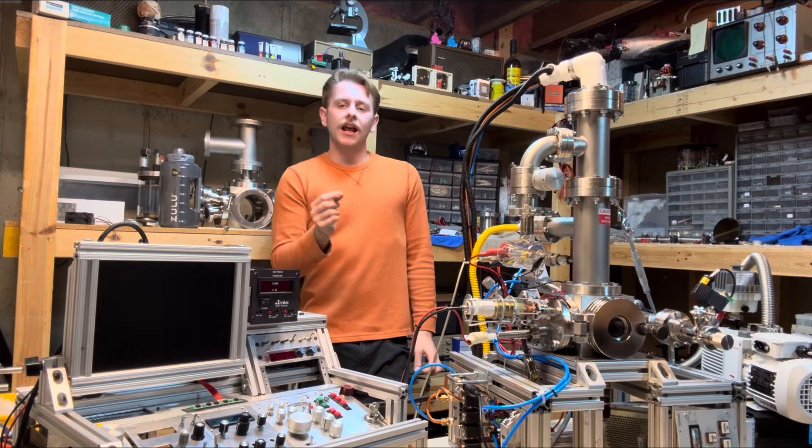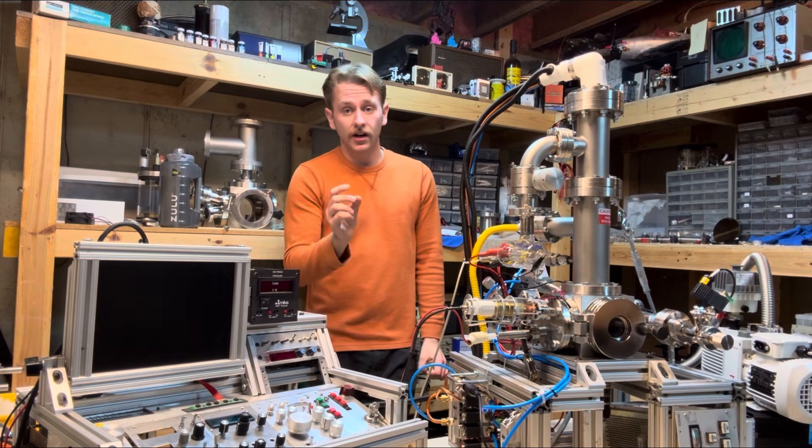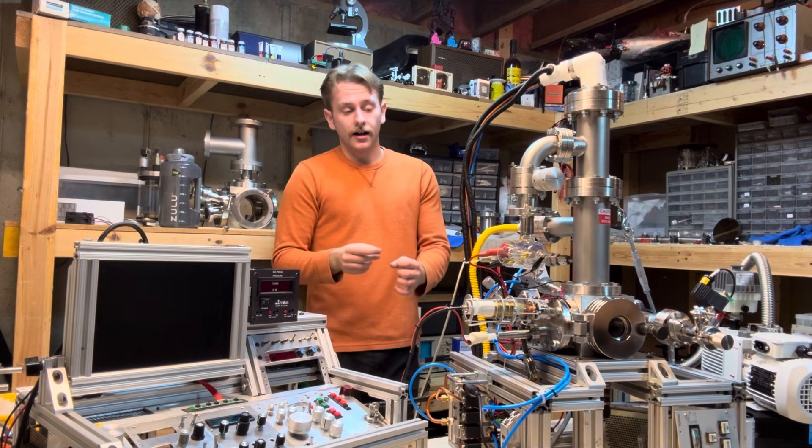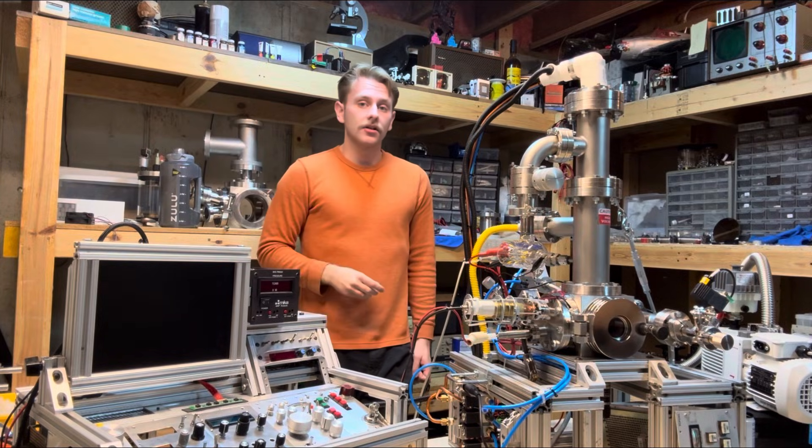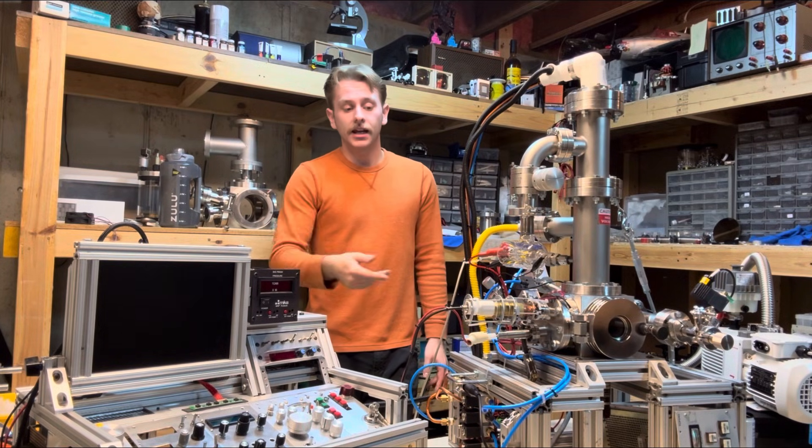So these electrons hit the plate, and it just gets amplified by about a million times for my case right here. So what started at like about 50 electron volts, very low energy electrons, is now still pretty low. It's like in the micro amps. I get a current pulse out of that.